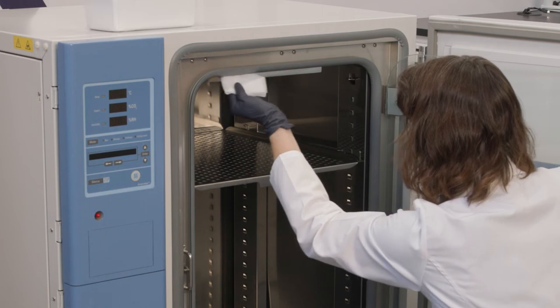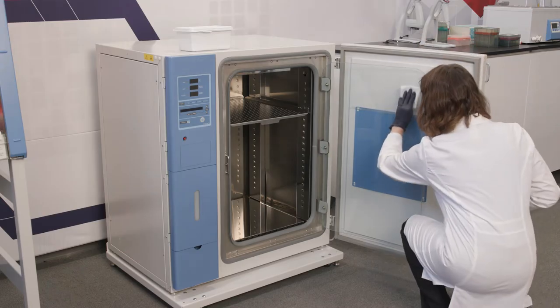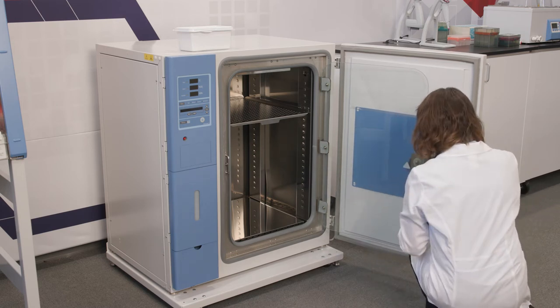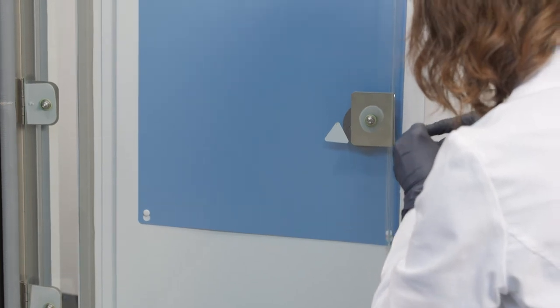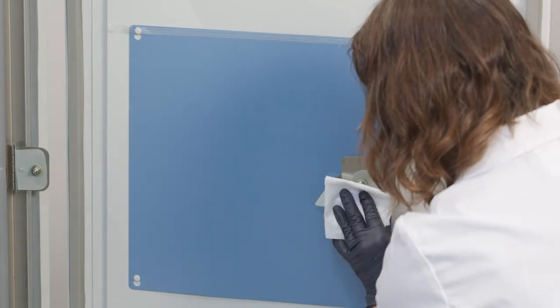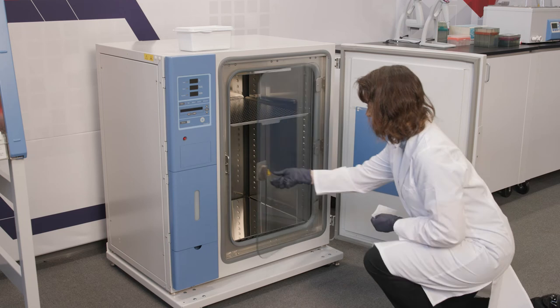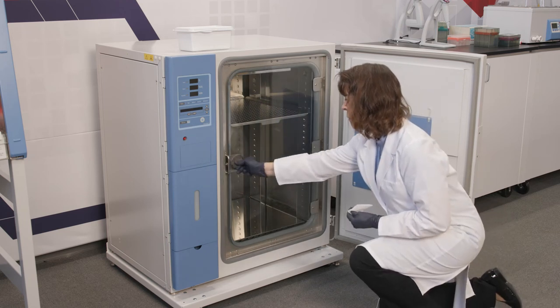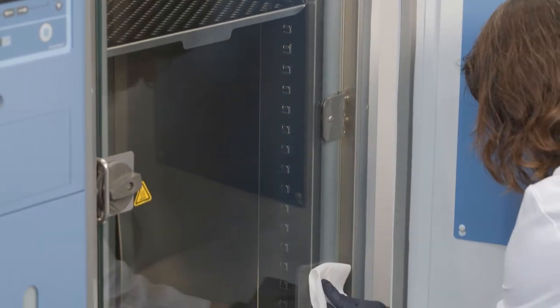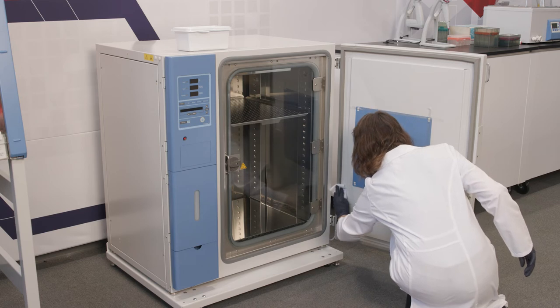Starting with the top inner corner, wipe the door gaskets, then wipe the inside of the glass door. Allow a few minutes for the disinfectant to work. The length of this time interval depends on your disinfectant choice and the manufacturer's recommendations. Then follow with 70% ethanol or 70% isopropanol and close the inner glass door. Following the same procedure, starting at the top inner corner, wipe the gasket and interior of the outer heated door. Close the door when complete.